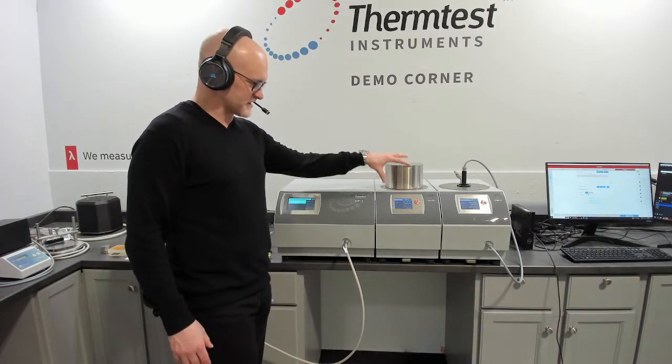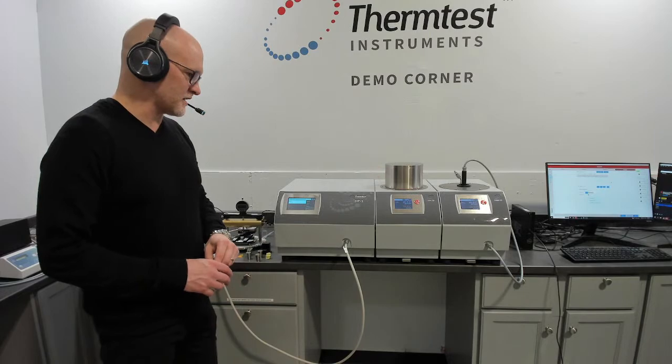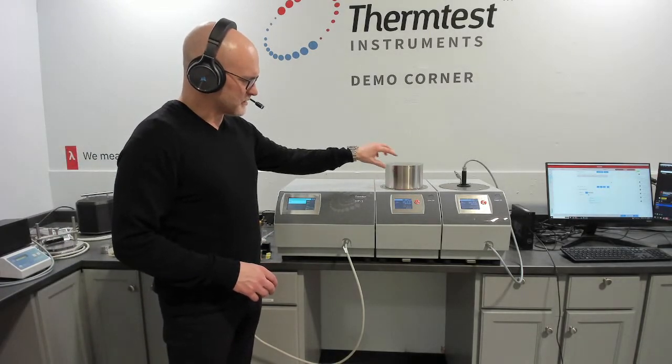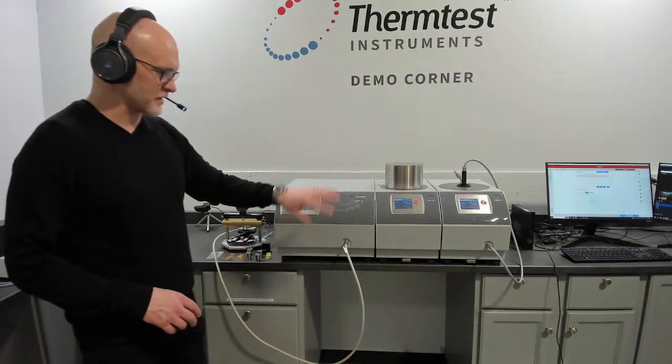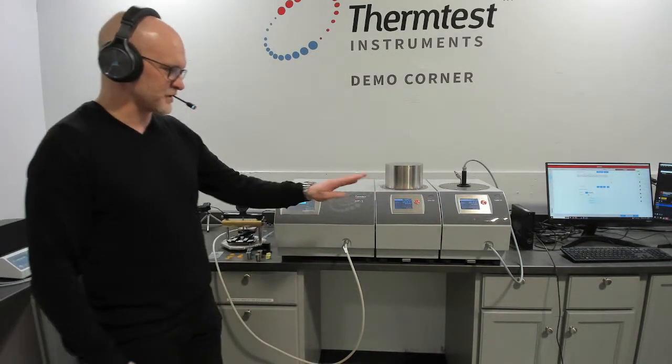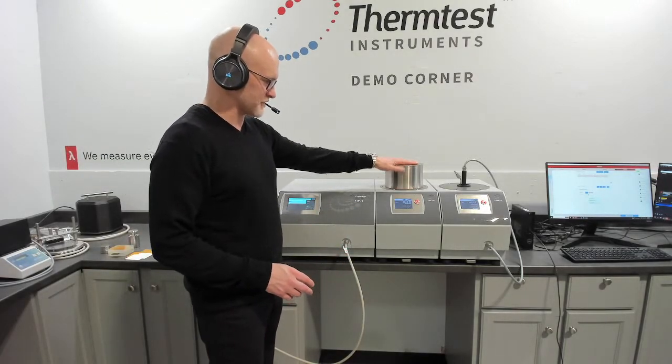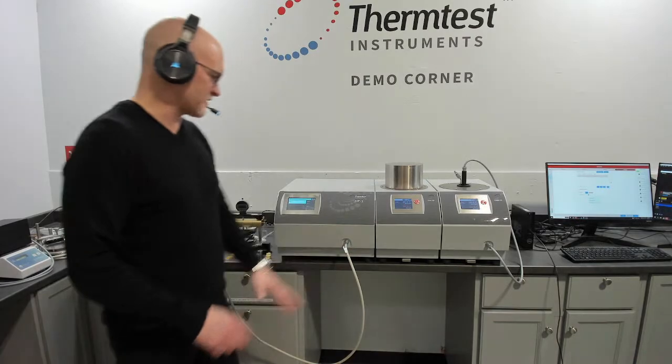We have available cells that can be used inside of here for testing liquids, pastes, and powders. Both of these have the ability to go down to cryogenic if it's needed and a couple other low temperature versions as well. So the overall temperature, depending on configuration, is 300 Celsius down to cryogenic depending on the configuration.